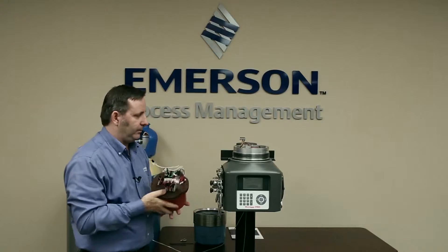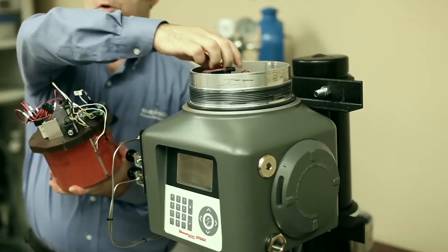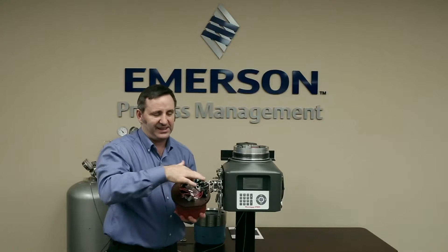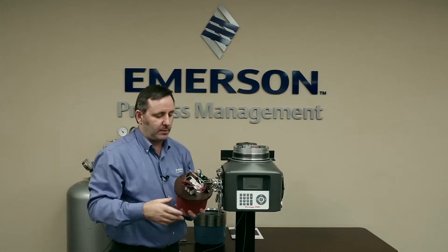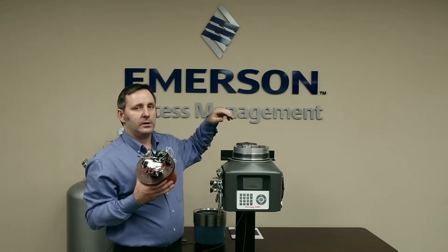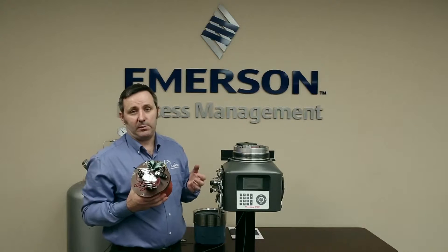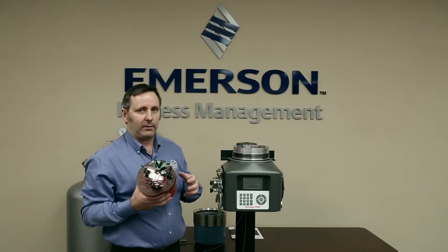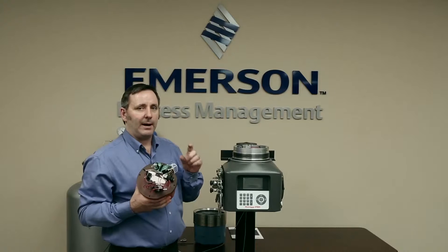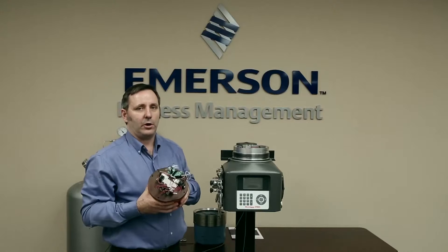Now it's really important when you take the oven off — there's a set of O-rings on here on what we call the feed-through. Sometimes when you take the module off, these O-rings actually stick to the bottom of the module. You want to make sure you take them all off. You also want to replace the O-rings when you put on a new module, because you don't know how long these O-rings have been there. When you get a new module, inside the kit will be a bag of about 10 O-rings to put on so that you have nice fresh O-rings.